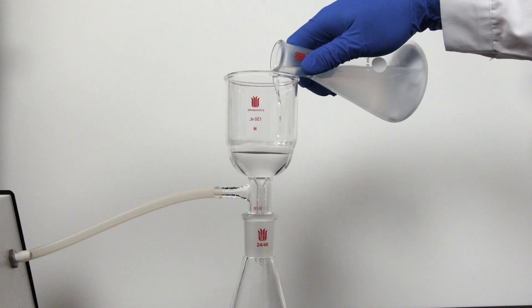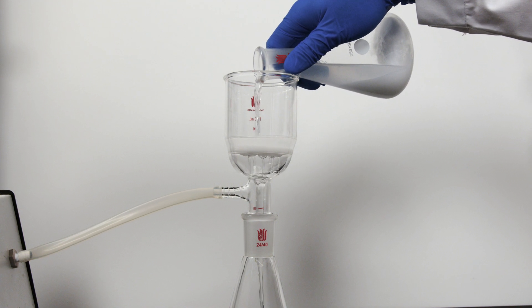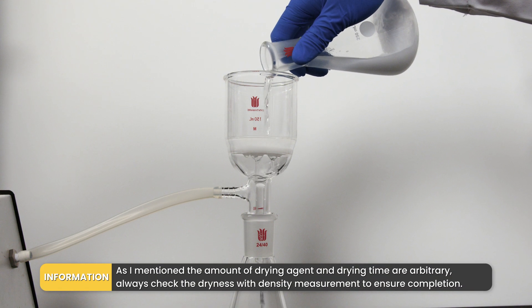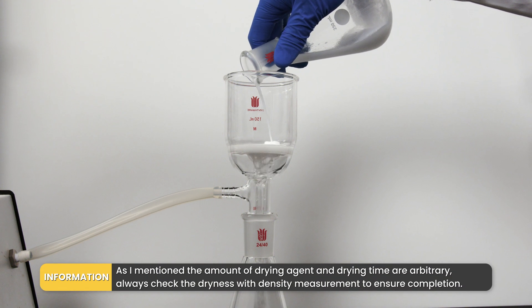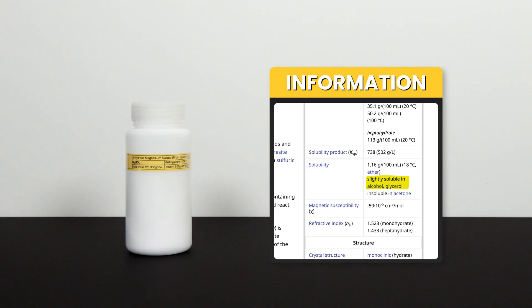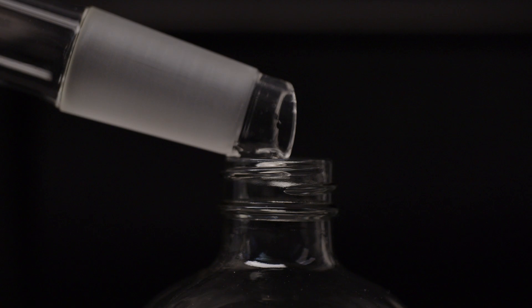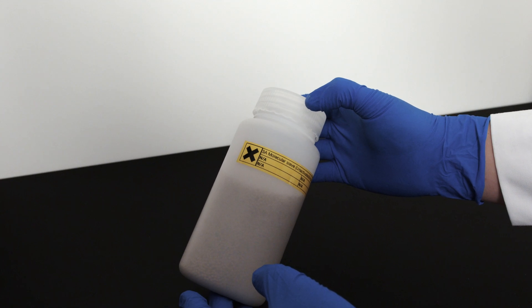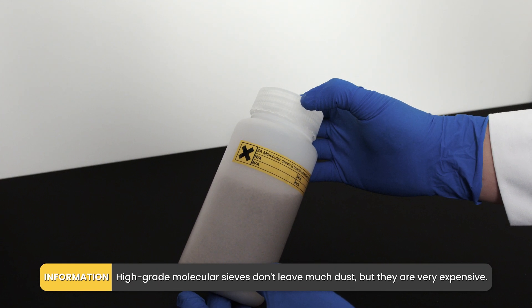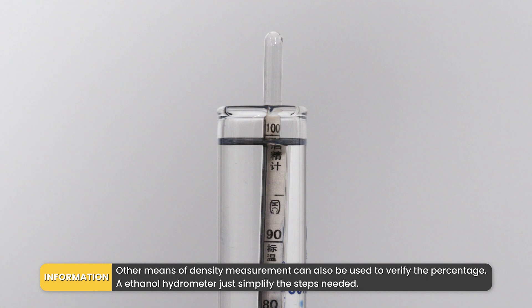Decant the solution and filter it through fritted glass or filter paper, then collect the filtrate in a flask for another distillation. I actually did a second drying with another 4 grams of anhydrous magnesium sulfate off camera, as I didn't swirl regularly on the first drying, resulting in only 98% ethanol. Since magnesium sulfate is slightly soluble in ethanol, it's not recommended to use the 100% ethanol right after filtration — perform another simple distillation to remove any remaining particles. According to the hydrometer reading, yes, we have arrived at 100% ethanol.